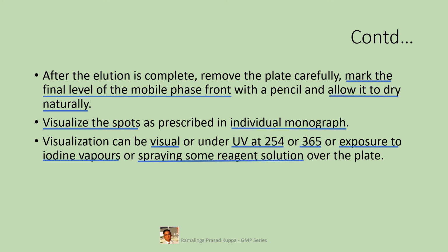The fluorescent zinc sulfide which is added in these GF254 TLC plates helps for visualization of spots. Precautions while viewing these ranges of UV are mentioned earlier. Always use safety goggles to view under these lamps. Never take these things for granted. It is a safety matter.